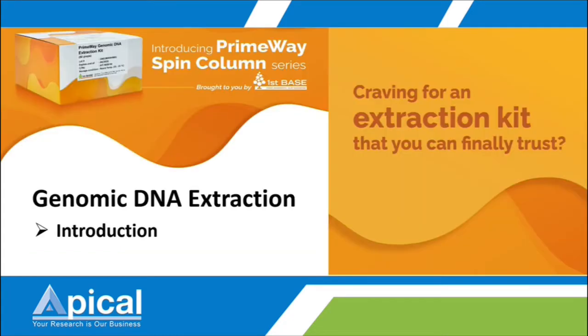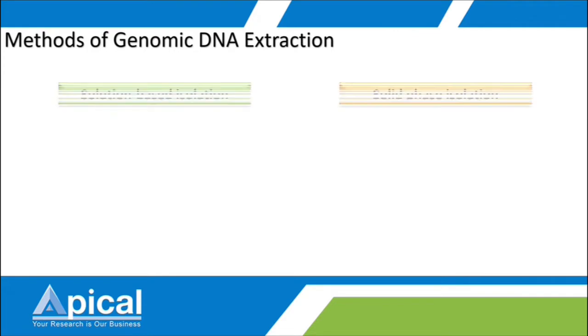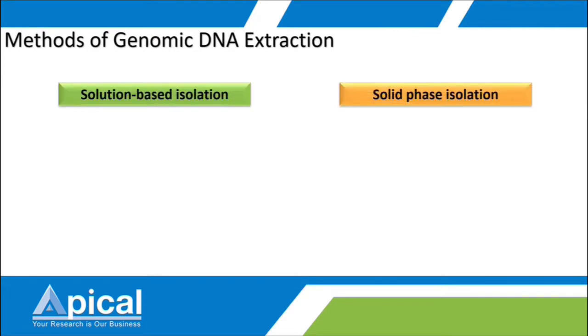Okay, so under this section, I will go through some introduction on gDNA extraction, and you can also say gDNA isolation, it's the same. For gDNA extraction, basically there are two methods used. One is the solution-based method and another one is the solid phase isolation method.